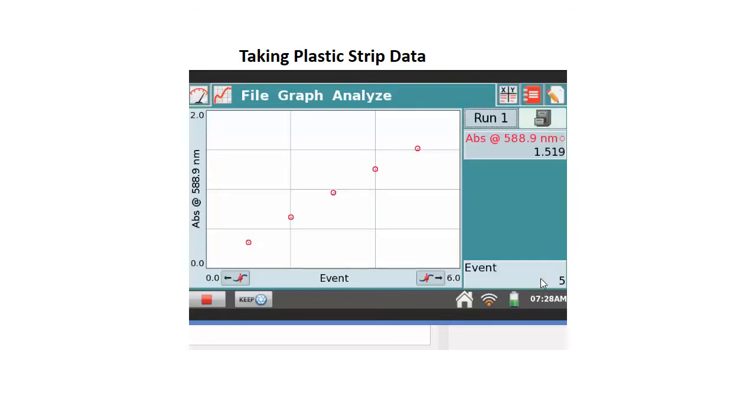Looks pretty good. Alright, so there's my stuff. You kind of get a sense of it. It looks like a straight line almost, doesn't it? And one of the things you might want to do while you're at this is up here in this table, this X and Y table, you'll find in your lab book a place where you're supposed to record these. It looks like your lab book only has 4 lines on it for recording them, 4 strips. You can squeeze 5 in if you want. 4 probably is enough as well because they're pretty good.